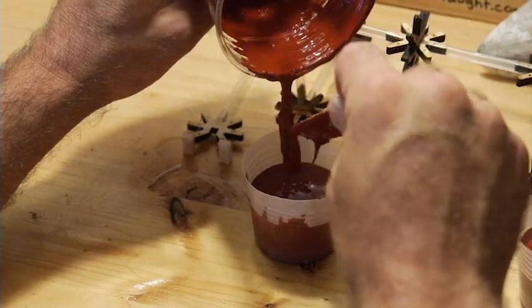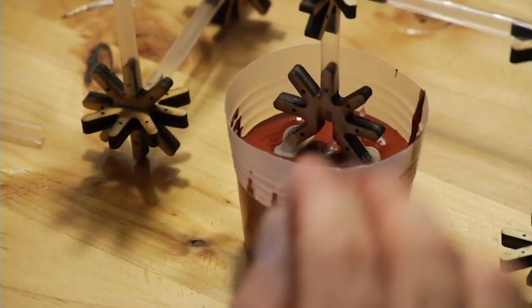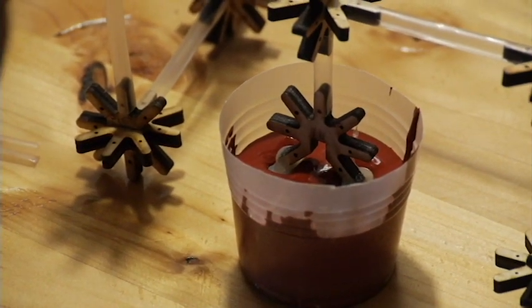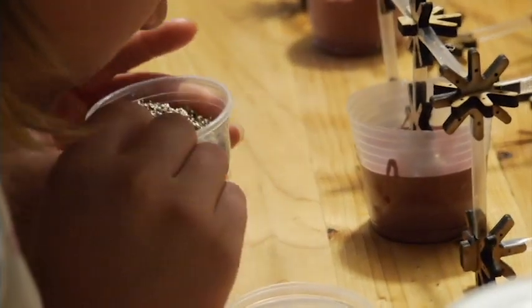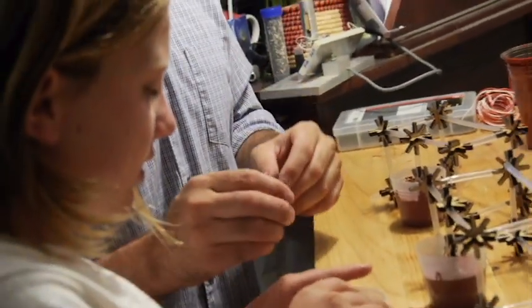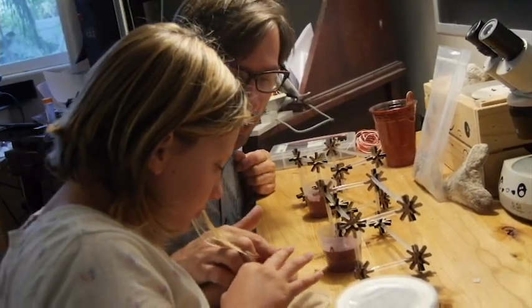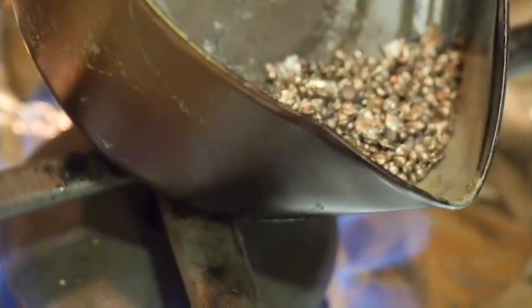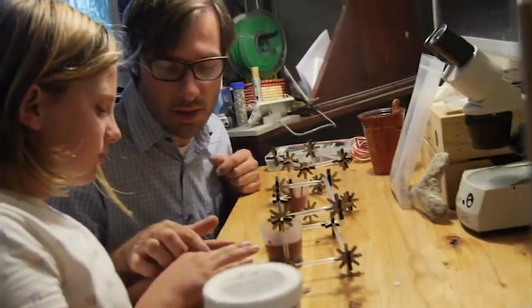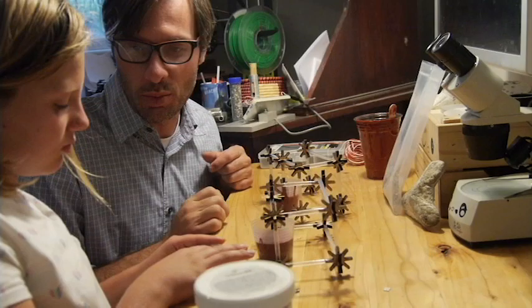I wanted to give you guys something special this lab, and so I figured out how to cast bismuth and indium gummy bears. Do you want to hold it for me? Okay, so this metal right here, it's pretty heavy, huh? This is indium, right? This is bismuth. Oh, it is? Yeah, so this is pure elemental bismuth. And the problem is, small like that, when it's in those small grains like sand, it can get lost and it gets stuck, falls off people's desks.